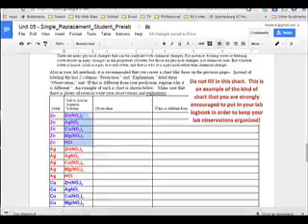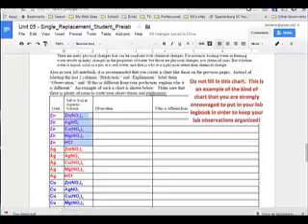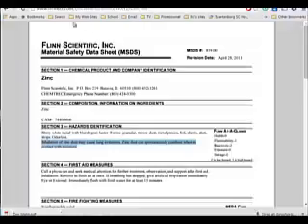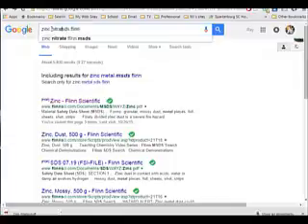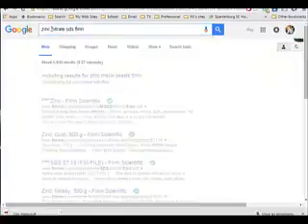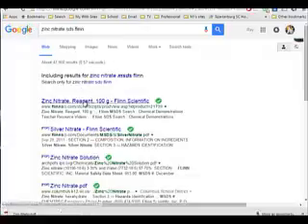So you're going to look up zinc nitrate. Well, let's go back over here and look up zinc nitrate. So instead of looking up zinc metal, let's look up a zinc nitrate SDS from Flynn. All right, well, that's the reagent. If I go to the reagent, the MSDS is listed there, but also here is the MSDS for silver nitrate. That's silver. Zinc nitrate, here it is right here.